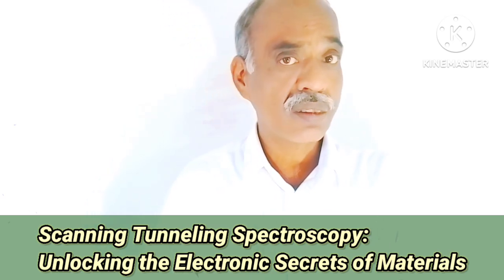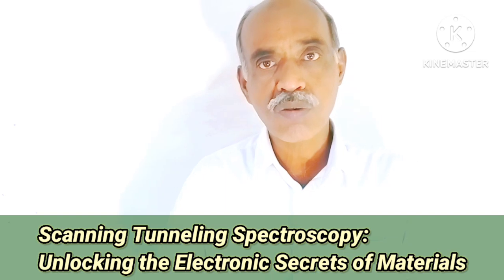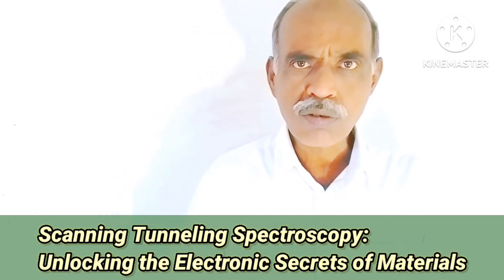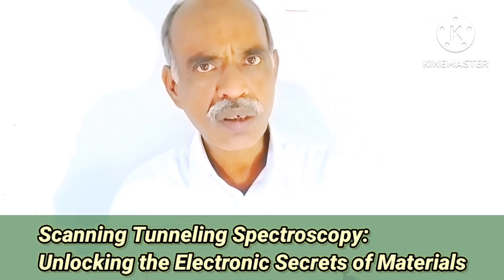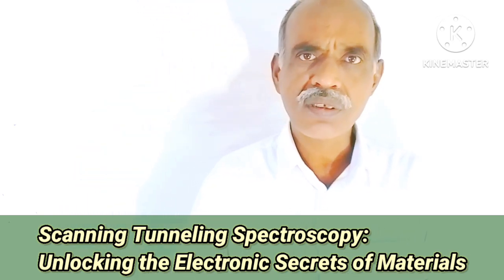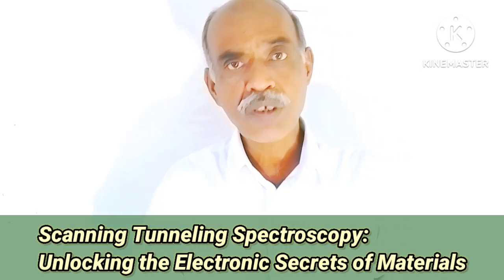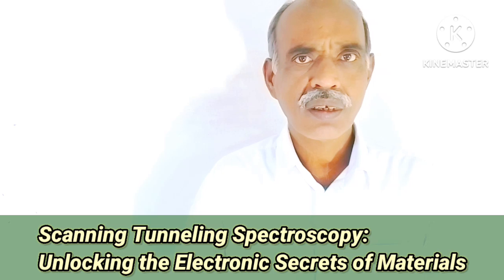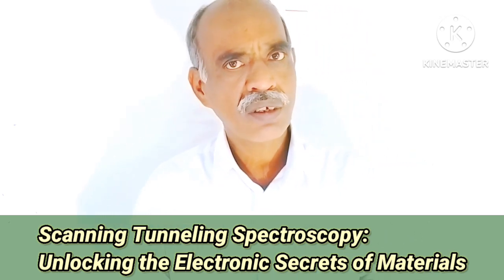That means this technology, STS, is very important. It plays a crucial role in advanced technologies, because nanotechnology, superconductors, and quantum computing systems are all advanced technologies. In all these fields, especially in material science, you'll find a great use of this technology, STS.